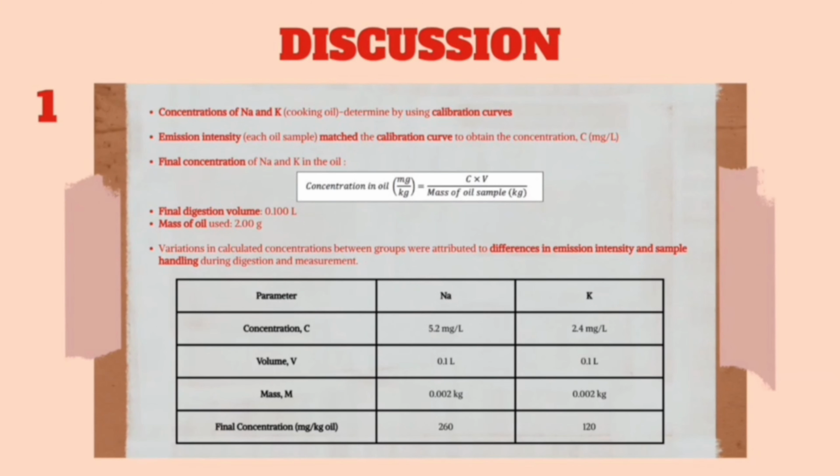Next, moving on to the discussion part. In order to calculate the concentration of sodium and potassium, we need to read their concentrations based on the calibration curves that had been recorded in the result part. For sodium, we obtained a concentration of 5.2 milligrams per liter, and for potassium, 2.4 milligrams per liter.